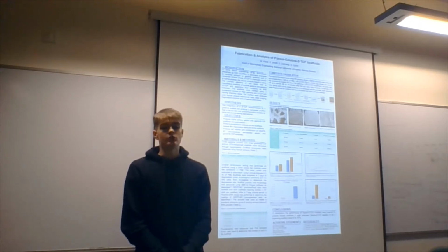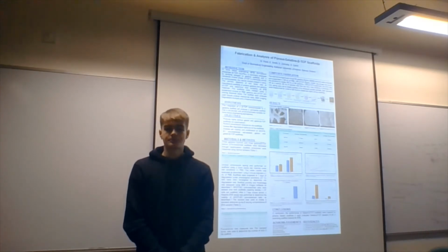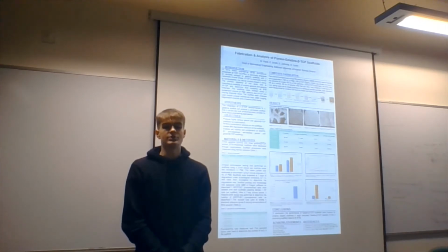80 ml of each solution was then put into a tray, creating a thickness of 5 mm for each scaffold, and then freeze-dried for 26 hours. To assess the scaffolds, their dimensions were taken and then they were subjected to uniaxial compression testing under wet conditions in PBS. Afterwards, their swelling ratio was evaluated. They were then subjected to 7 days of degradation testing under physiological conditions and were weighed again to determine the degradation rate. The scaffolds then had their porosity and morphology assessed using scanning electron microscopy and ImageJ software.